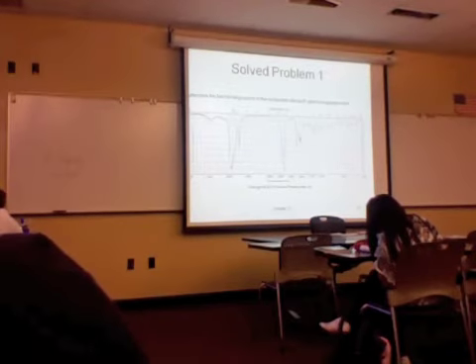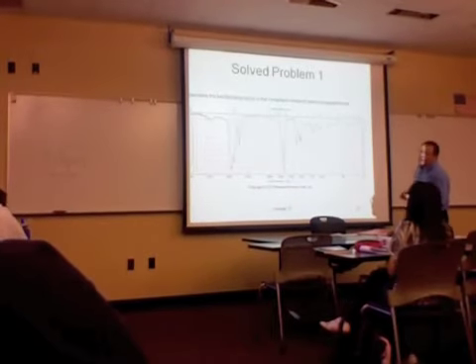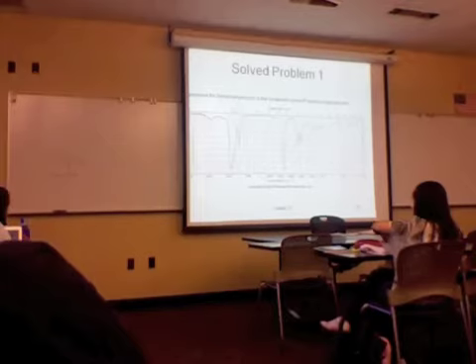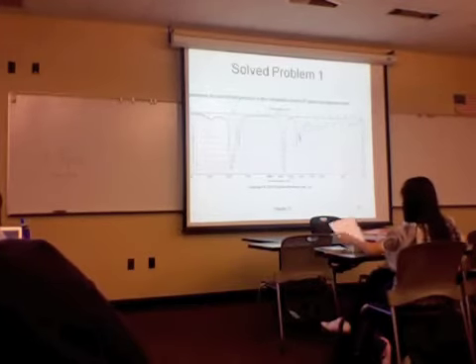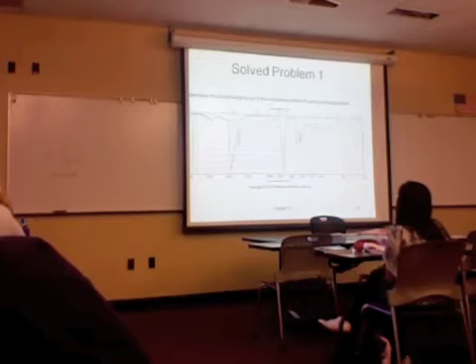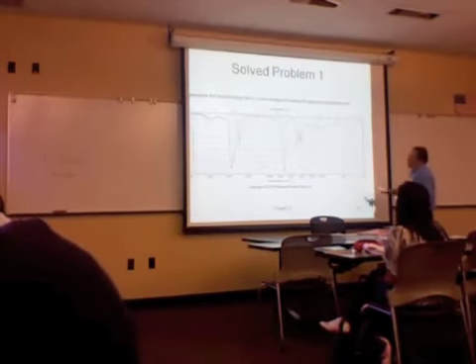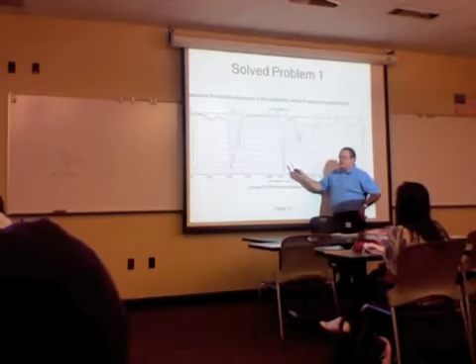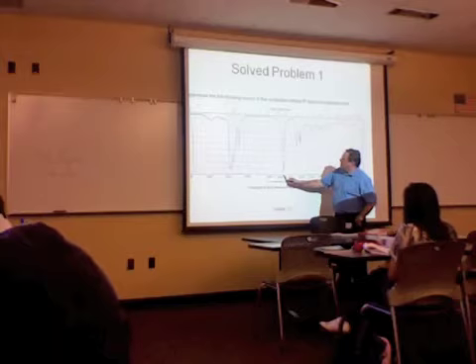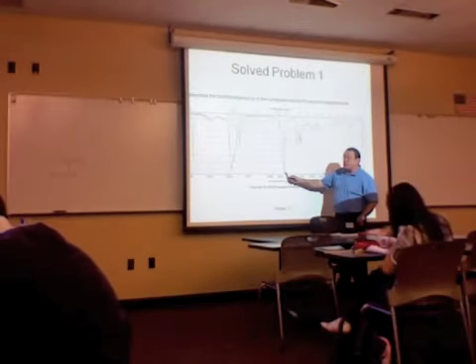Here's a problem, and the peaks are not labeled in terms of their wavelength. Let's look at this as a fresh problem for us to consider. What do you notice right off the bat? That big, strong carbon. Yeah, not nitrogen, but carbon-oxygen. Notice down here, it looks like, oh, here's 1700. So it looks like maybe around 1725, a big, intense band, most intense band in the spectrum.